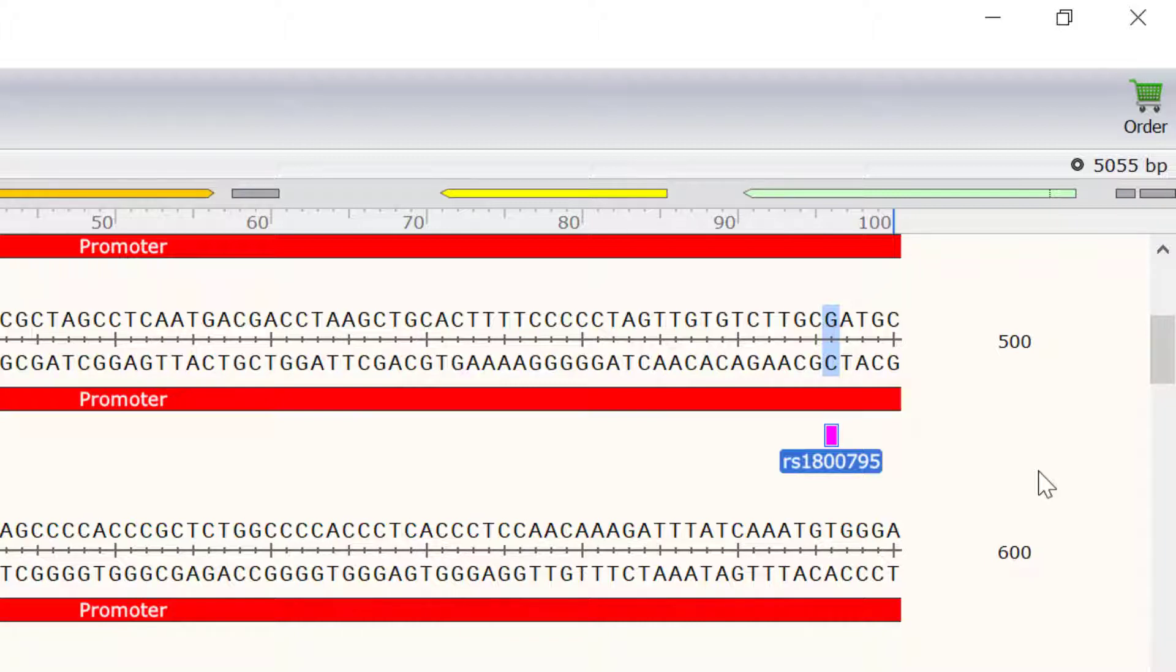In my plasmid, I have the G allele. What I want to do now is to create a different version of this plasmid that contains the C allele. To do this, I will create mutagenic primers for a mutagenesis experiment.